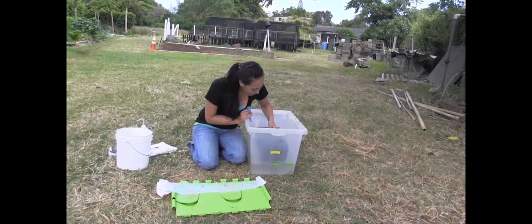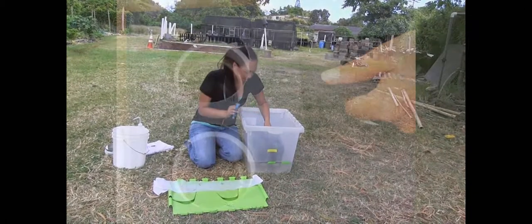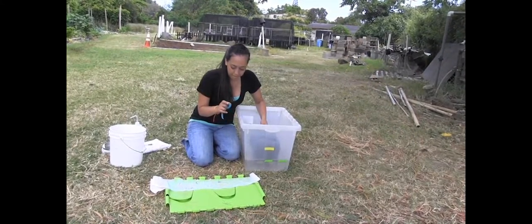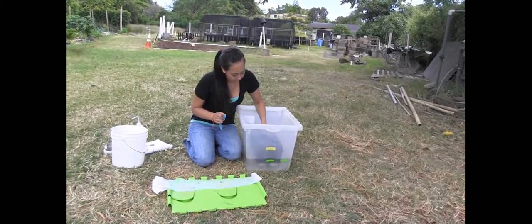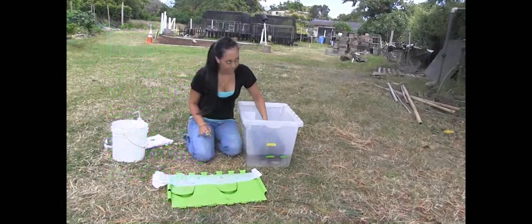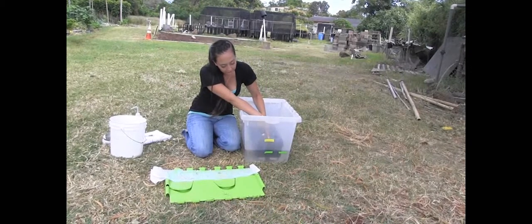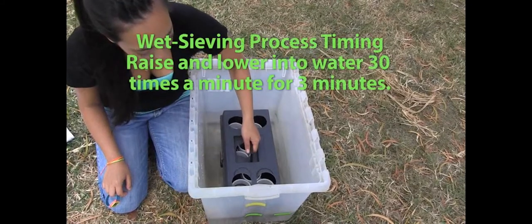Then we're going to put our apparatus into the water — just use the viewing holes on top and put the apparatus into the water so the soil is just submerged underneath. Then we're going to start our timer and lower the apparatus into the water. You can go until the bolts hit the bottom of the container and then use this little two centimeter piece of tape as a reference for how high you need to go back out. We do this up-and-down motion 30 times per minute for three minutes.